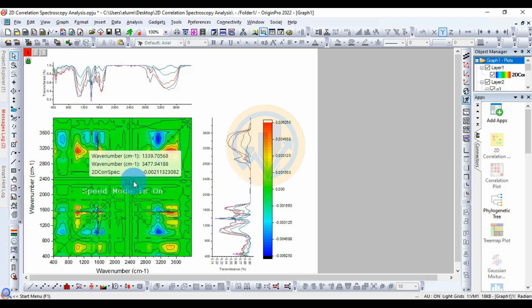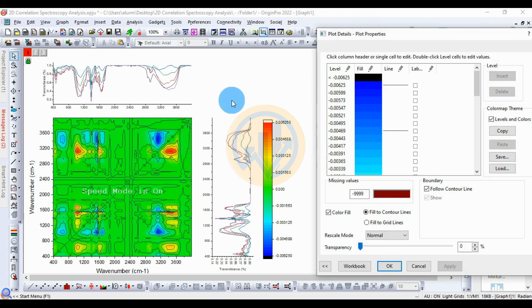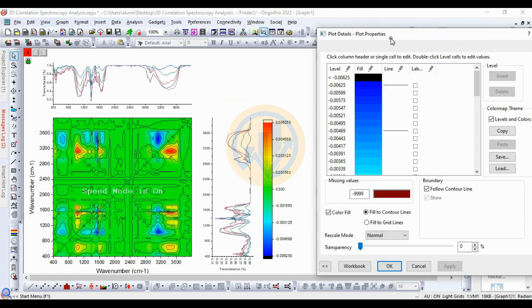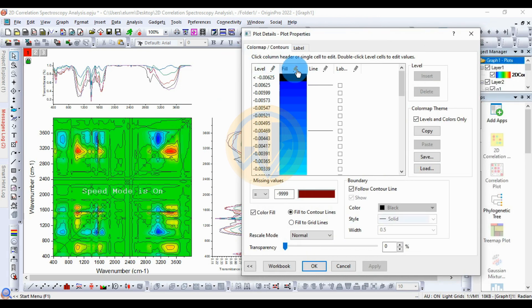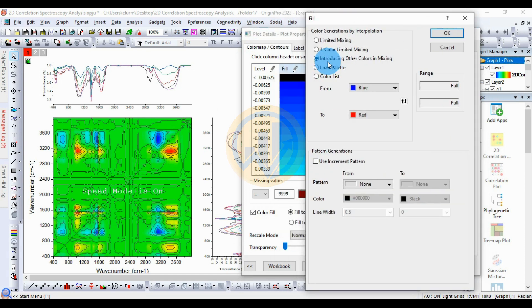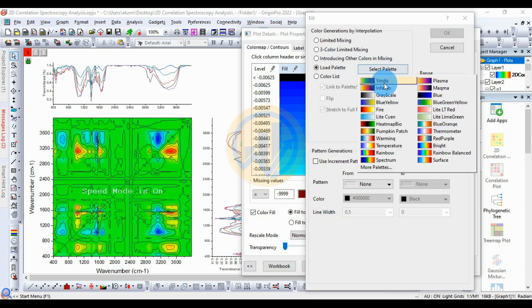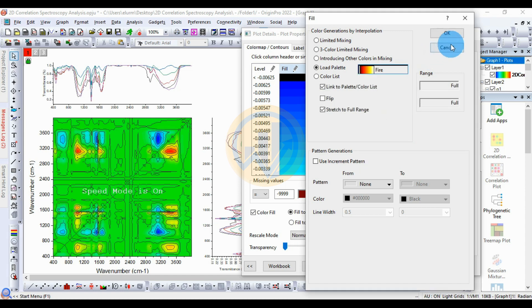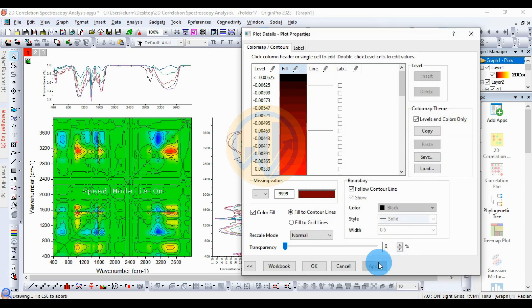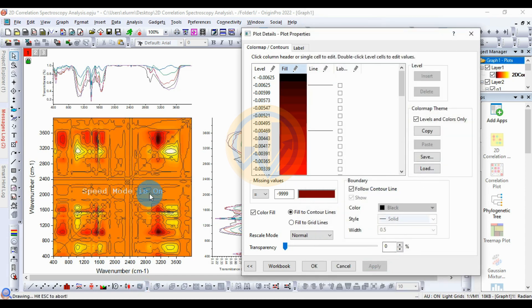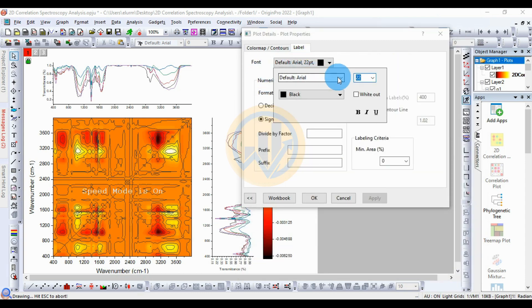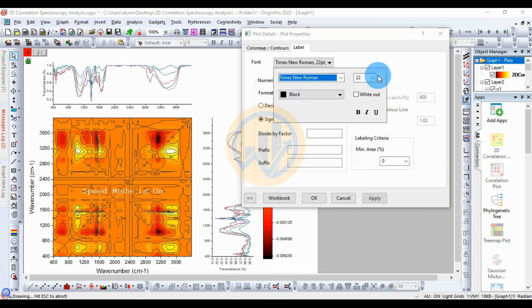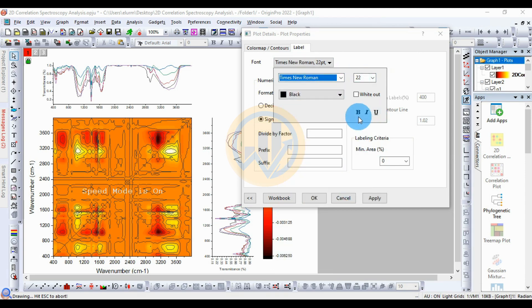Now we customize the graph. Double-click the graph to open the plot details in a new tab. Click the fill button to open a new tab and change the color. Choose a new color you like, then click OK and apply. The color is changed. Next, for the label, select the font name as Times New Roman. If you like, click bold, then apply.